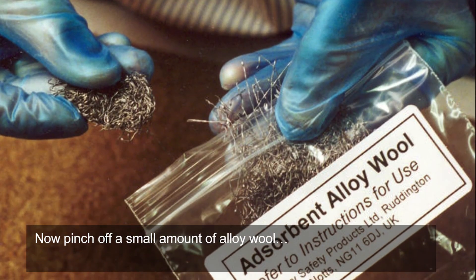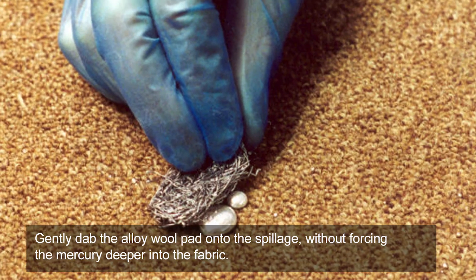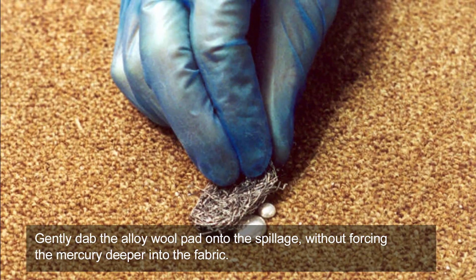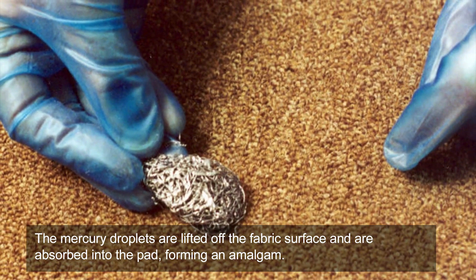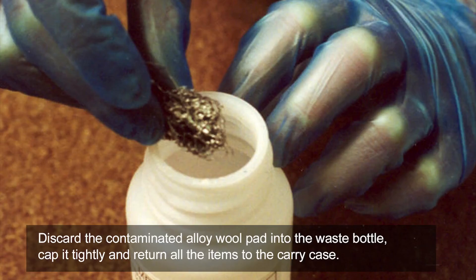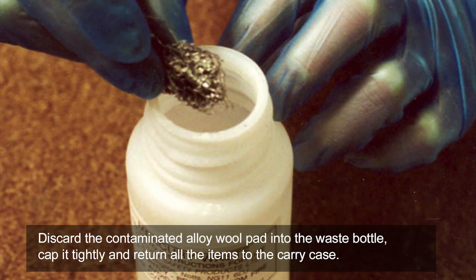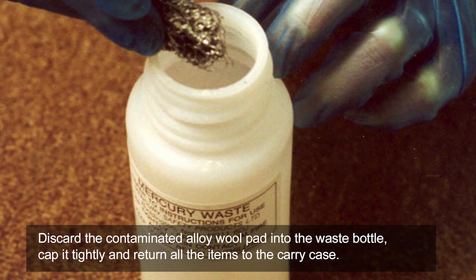Now, pinch off a small amount of alloy wool. Gently dab the alloy wool pad onto the spillage, without forcing the mercury deeper into the fabric. The mercury droplets are lifted off the fabric surface and are absorbed into the pad, forming an amalgam. Discard the contaminated alloy wool pad into the waste bottle, cap it tightly and return all the items to the carry case.